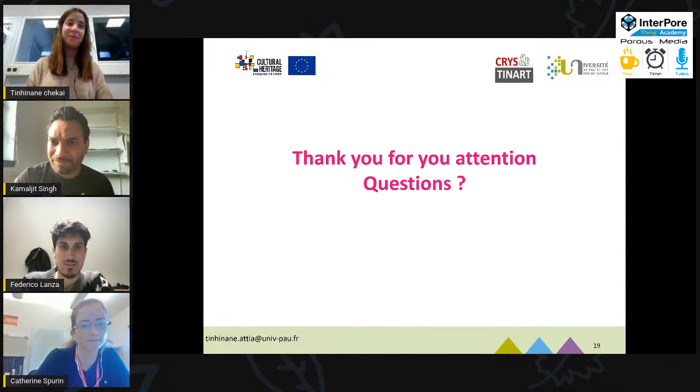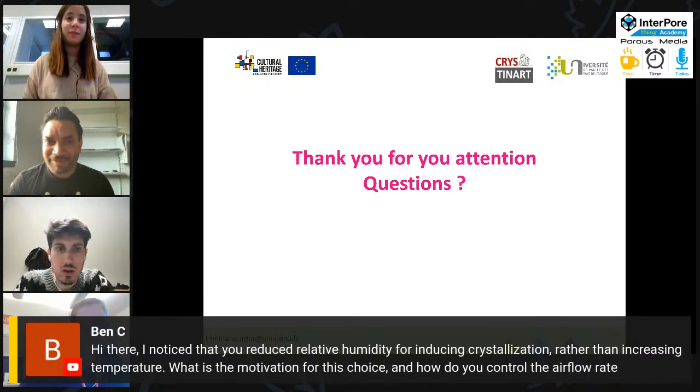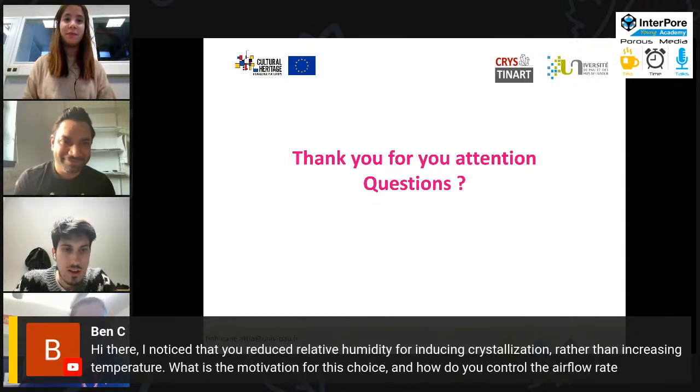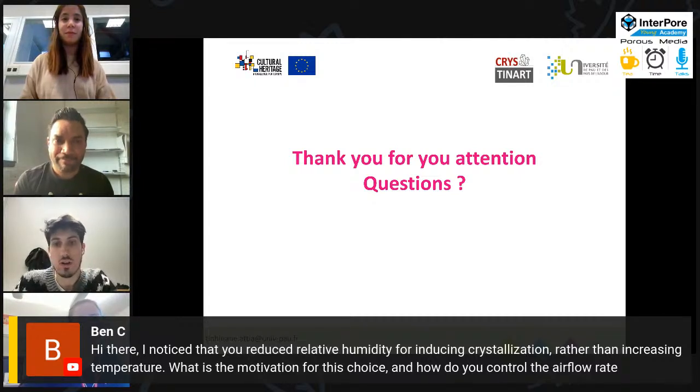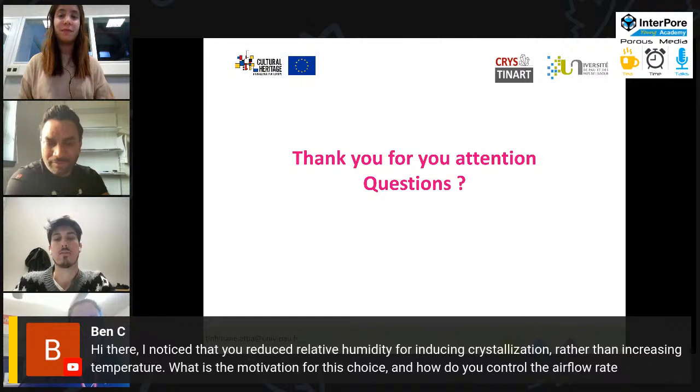Okay. Then if there are no other questions, there's one in the comments. Oh, okay. How can I see? Okay, thank you. So I'm going to read it. Hi there. I noticed that you reduced the relative humidity for inducing crystallization rather than increasing temperature. What's the motivation for this choice? And how do you control the airflow rate?